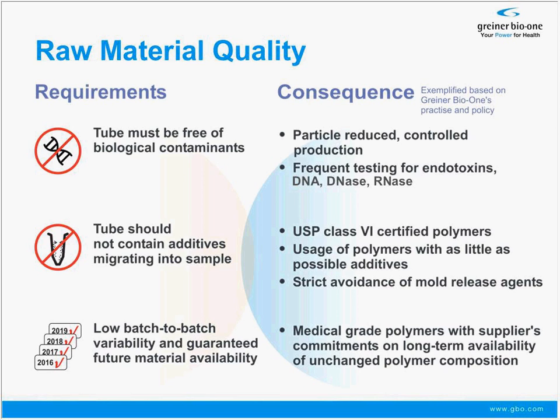It's a rather strict test about biocompatibility of raw material and or products. This test tells us if something is biocompatible. It's more from medical applications, but if something passes this strict test, it's also very likely that it has a very low content of additives that could leach into a sample.